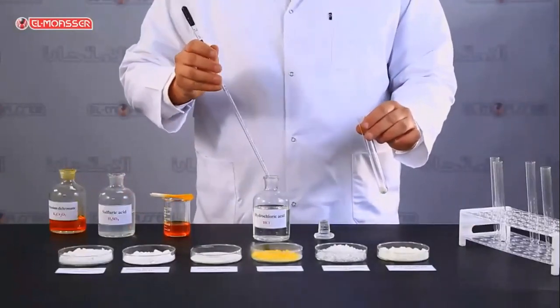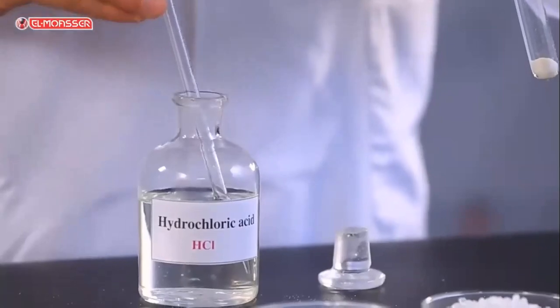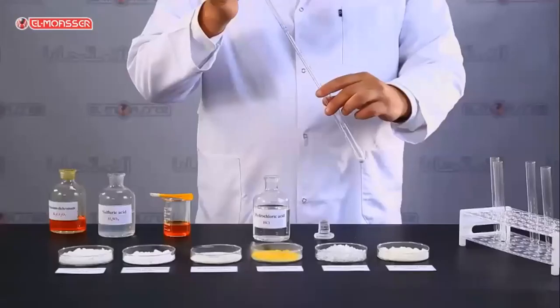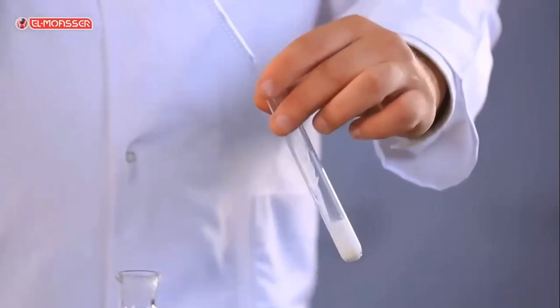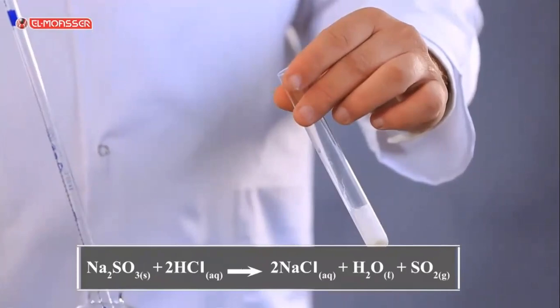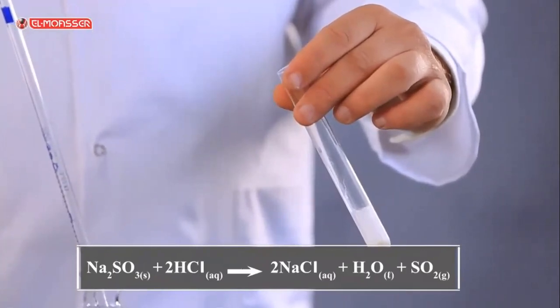Add drops of the group reagent diluted hydrochloric acid to sodium sulfite salt. What do you observe? Effervescence takes place due to the evolution of sulfur dioxide gas.